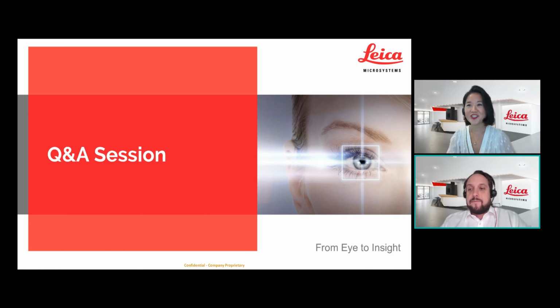I see another question. What type of fluorescence illuminator? So this is a wide field microscope. So we're using an LED light source for the different wavelengths. So it's nice, stable LED illumination. And we do what would be sort of Cy2, Cy3, Cy5, and Cy7. So down into the near infrared.